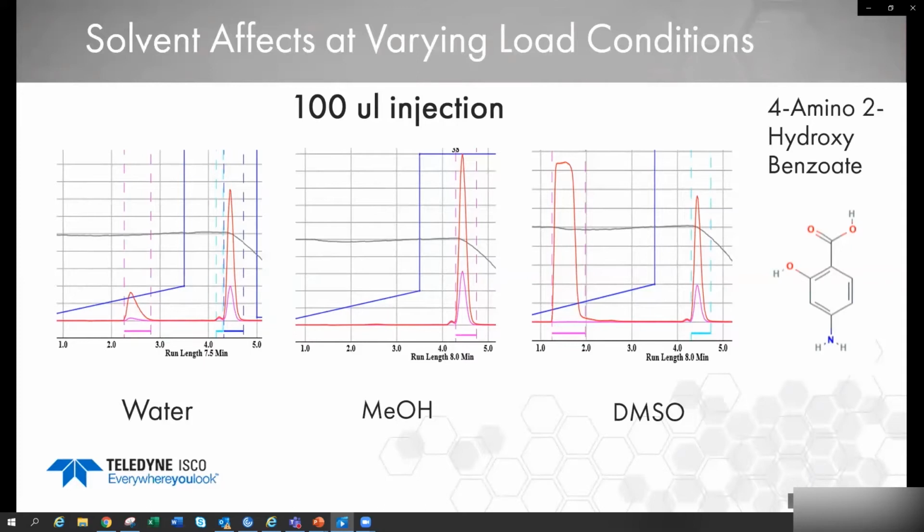The problem is we also don't see too much here. It's good chromatography, and good chromatography there on the DMSO. The drawback is we do have a UV chromophore at 214 to 220 that we can see in the chromatogram, which usually isn't too bad because we can still see the 254. People that use DMF will have both a 214 and a 254 trace for the void, so sometimes that can be a little bit difficult.